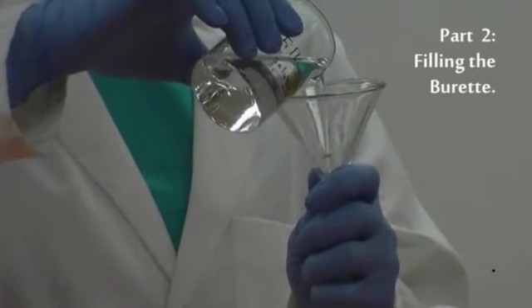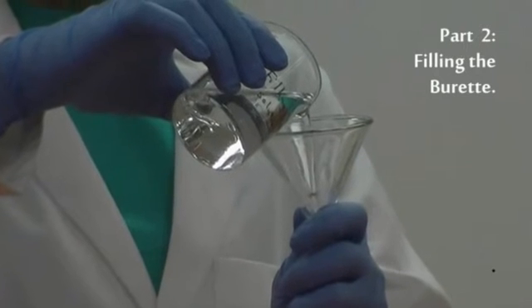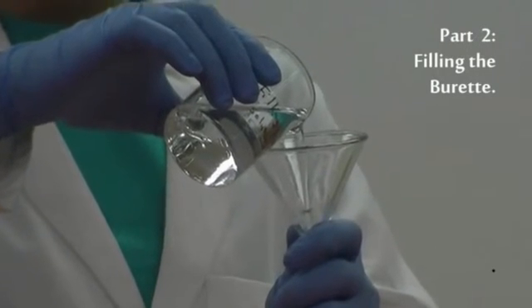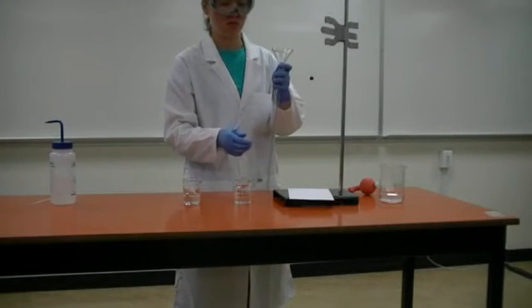Now we'll show you how to fill the burette. Again, we'll first demonstrate the technique.